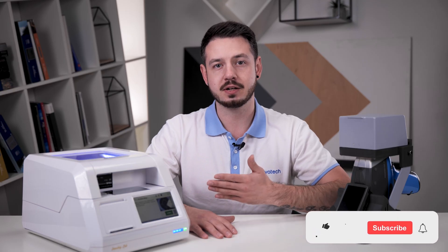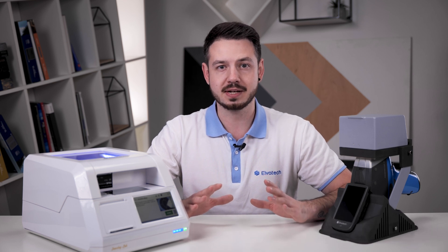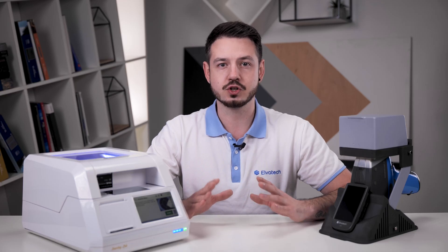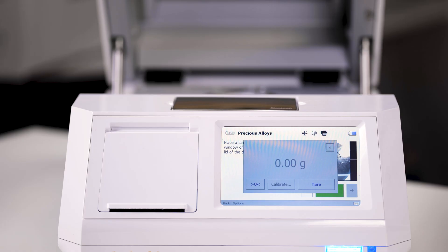Before we start analyzing, let's turn on our spectrometer. It is important to note that the Jewelry Lab can operate either on mains power or on the built-in battery, which is especially convenient in places where there is no access to mains power. The next step is to select the appropriate calibration for the analysis, which is important to ensure maximum measurement accuracy.